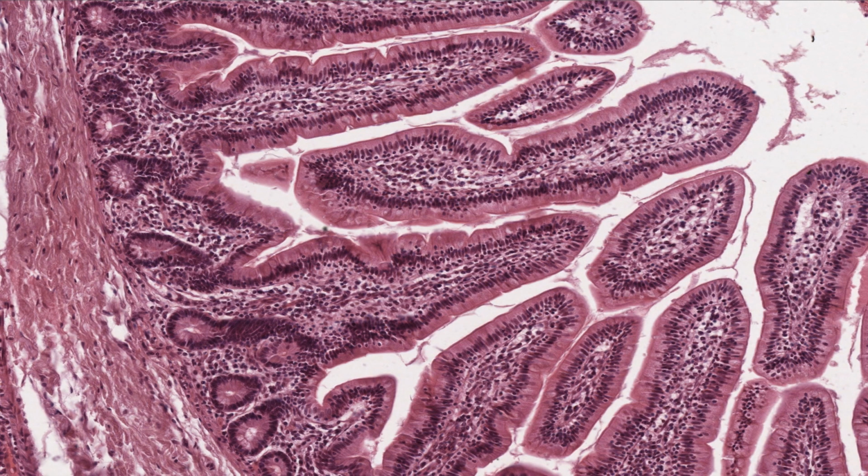Highly cellular loose connective tissue, such as you see here, is often supported by delicate reticular fibers instead of, or together with, coarse type 1 collagen fibers. Note that the cellular connective tissue directly under the epithelium, the lamina propria, abruptly changes to ordinary loose connective tissue at its boundary with the underlying submucosal layer.